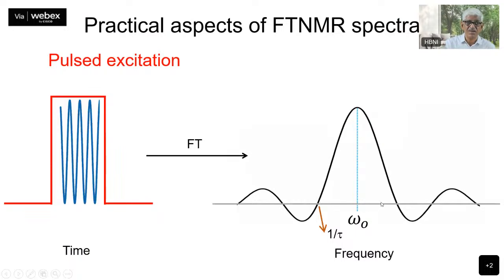10 to the power 5 here and 10 to the power 5 here. So 100 kilohertz, 100 kilohertz. Total from here to here will be 200 kilohertz. Of course, they will have different amplitudes. Amplitude here, they are all different, right? But when you want to apply 2h1 cosine omega t, you are considering your h1 to be the constant, the same for all the signals. Otherwise, different ones will get excited to different extents.